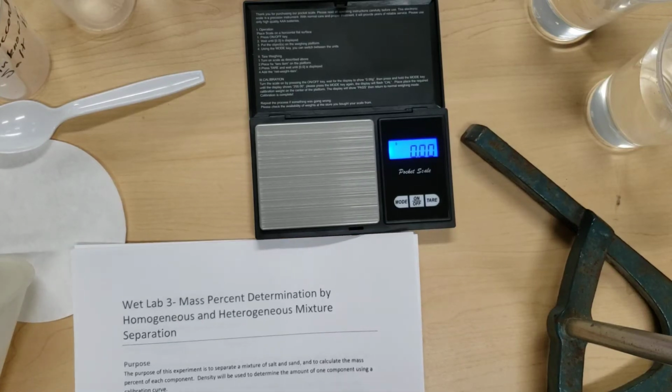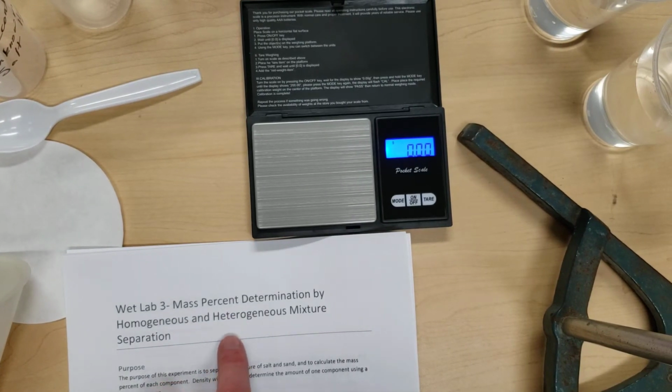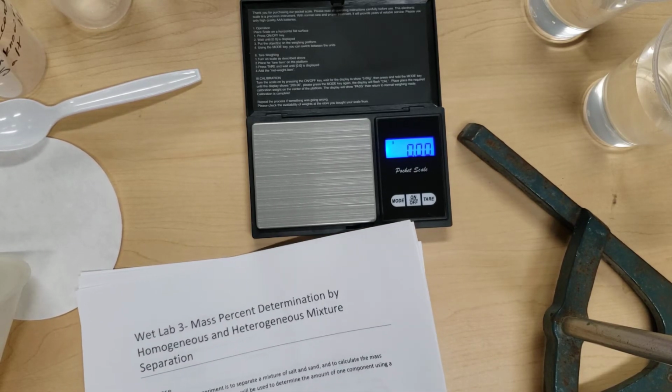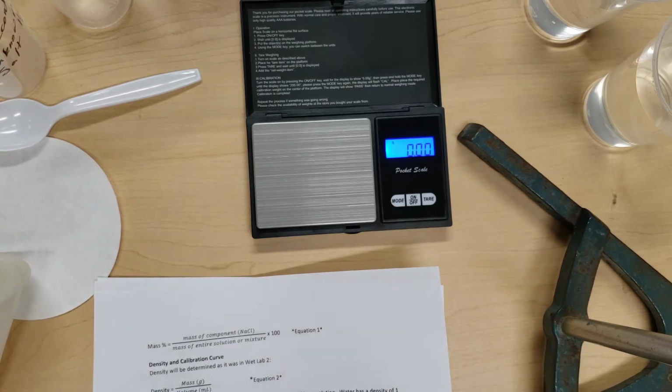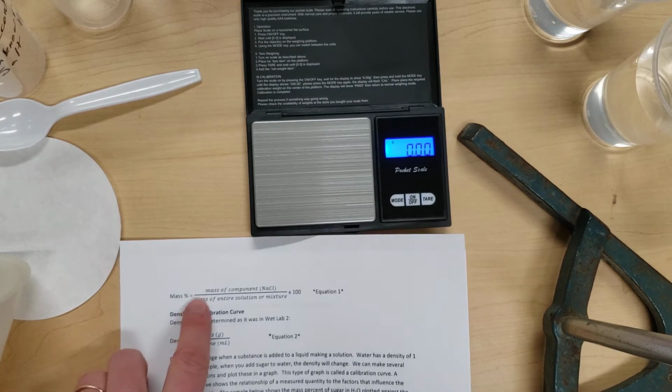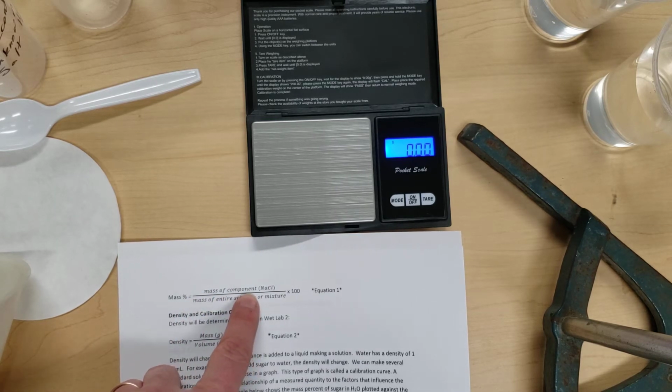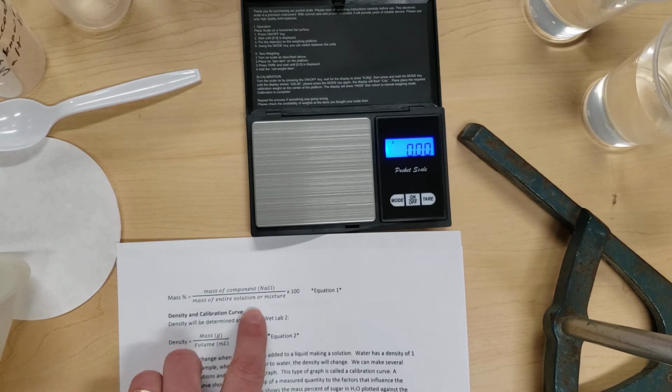For Wet Lab 3, we are going to be finding the mass percent and density of a mixture. So we are going to make a mixture of salt and sand, and from there we are going to find the mass percent. The mass percent is a measurement that compares the mass of one component. In this case, for the lab, we're going to be looking at sodium chloride or salt and compare it to the overall mass of our mixture or solution.